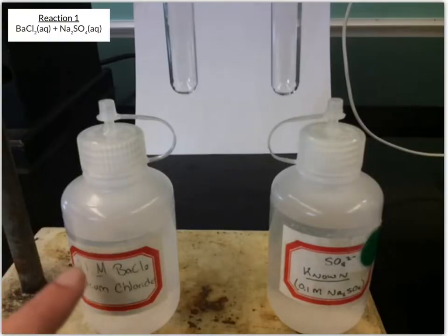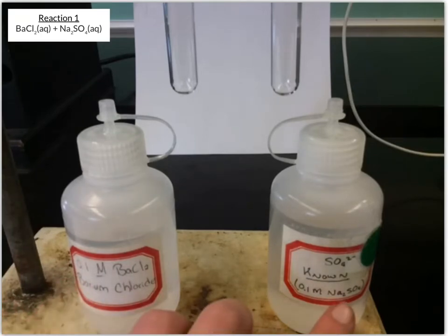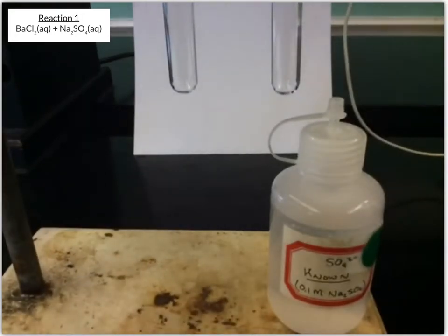For the first reaction, we're going to react barium chloride with sodium sulfate. And so first I'm going to take about 1 milliliter of each of these solutions and put them in these test tubes.